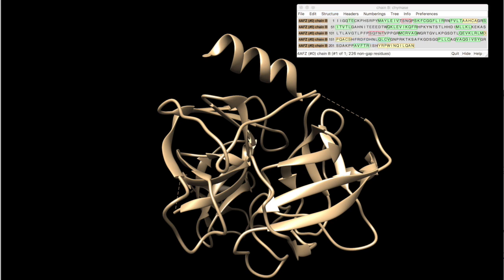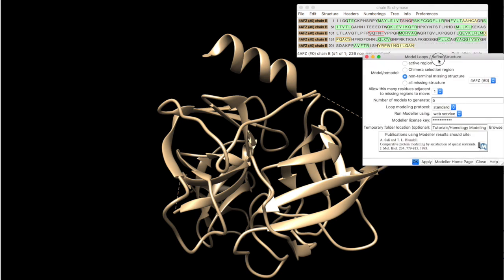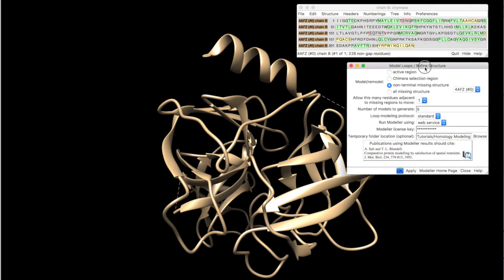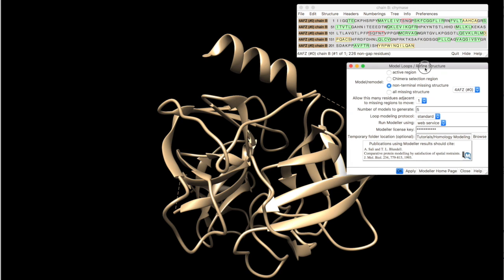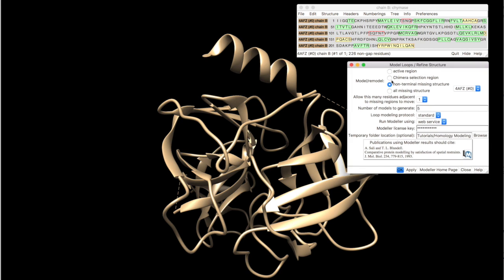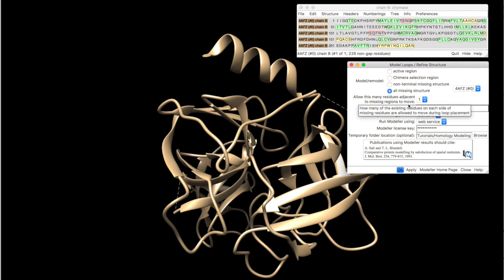And what will be shown here, it will model the missing region. So, let's do all missing structure for this model that is shown here. And I want to generate only one model, the best one.